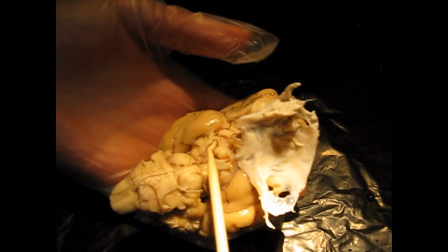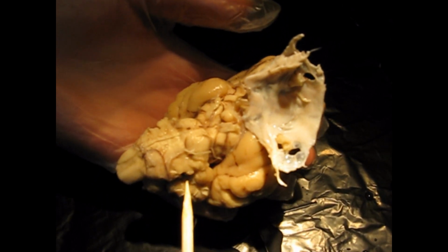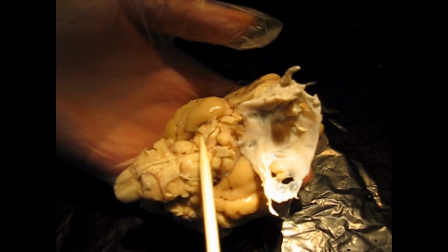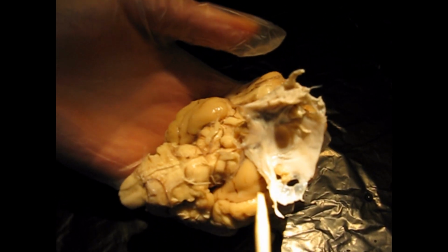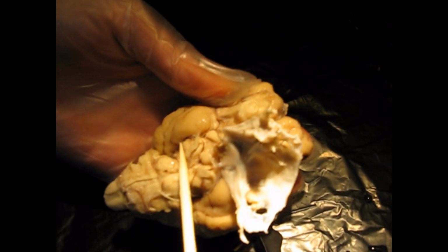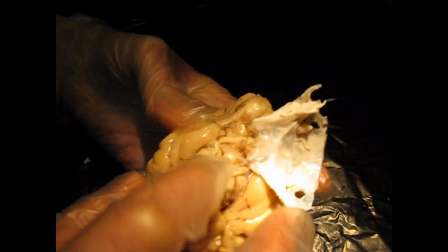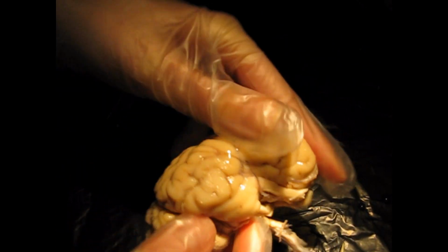Okay, and remember, it's the mesencephalon, metencephalon, diencephalon. Okay, so first we're going to look for the mesencephalon, or that midbrain, which is right here. Okay, and so not this bulge yet. So it's the midbrain, and I'm just going to show you. So here's the anterior aspect. I'm going to flip it over.